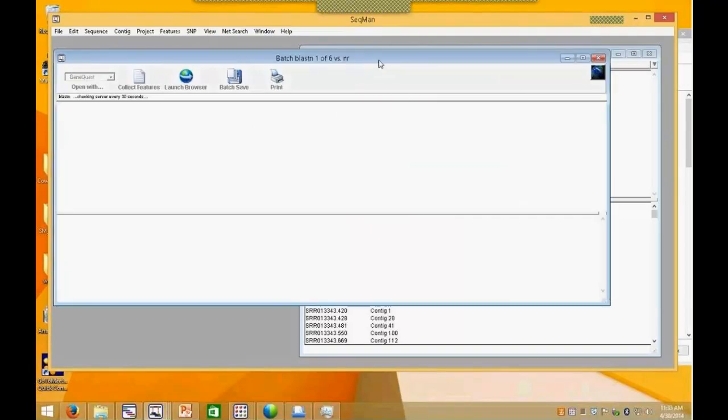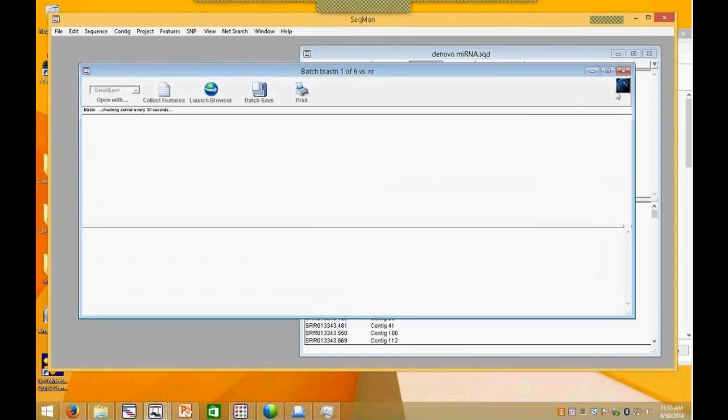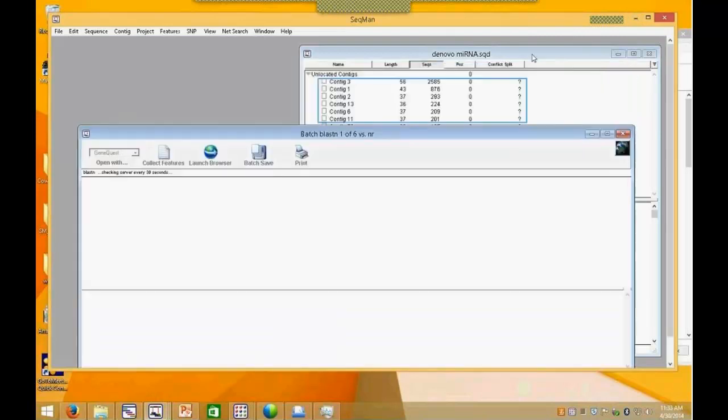And wait for those blast hits to come back. You can see the little globe that's spinning here. That means it's retrieving results. We'll come back and look at this, because sometimes with the webinar running too, the blast spools back a little bit more slowly. But this is a way to de novo assemble.